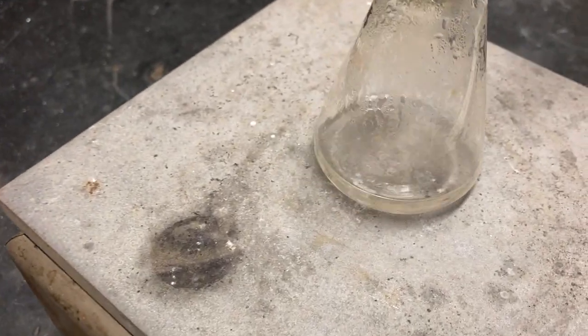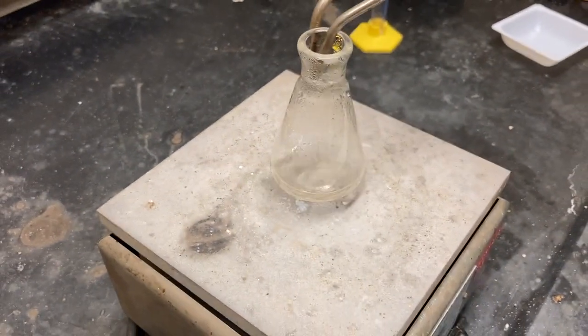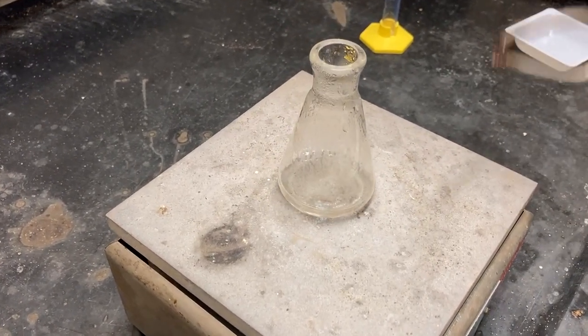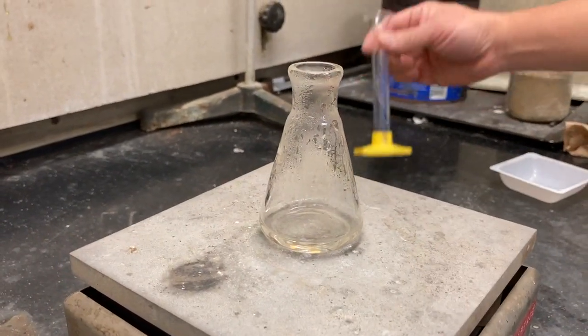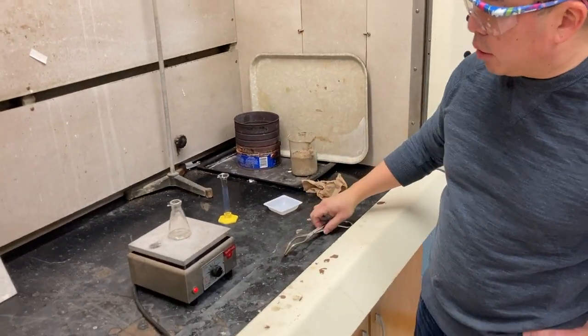Alright, so the magnesium's all reacted, and that means it's all dissolved. So what we're going to do is we're going to let this sit and let the water evaporate out, because the hydrochloric acid was a solution. It contained HCl and water. And the water we need to leave because we don't want the weight of water included.